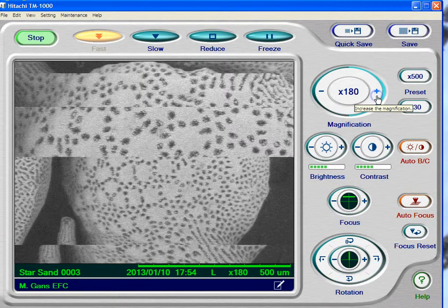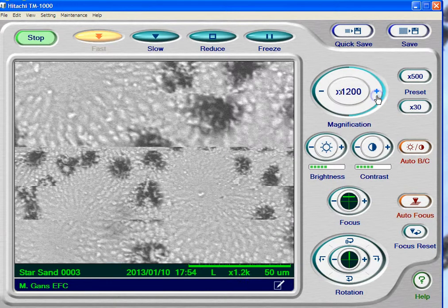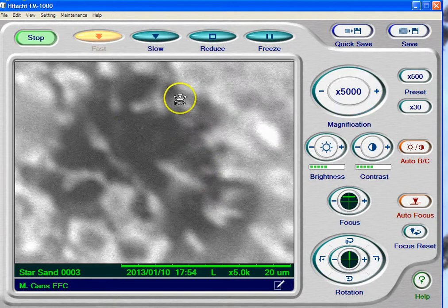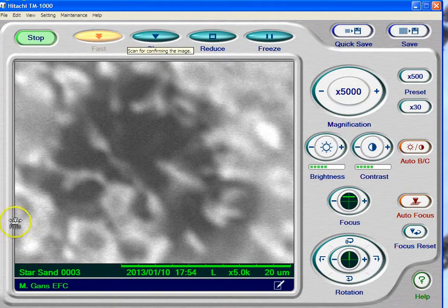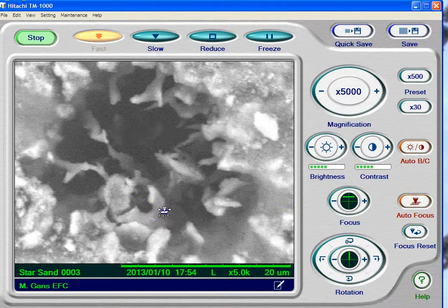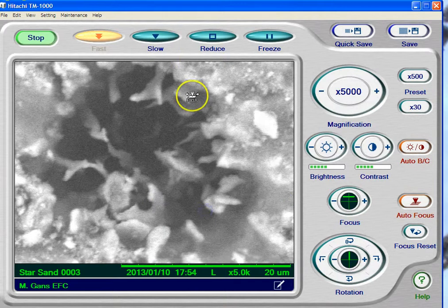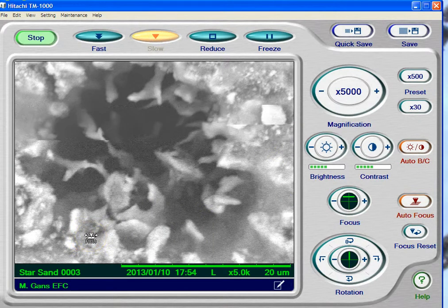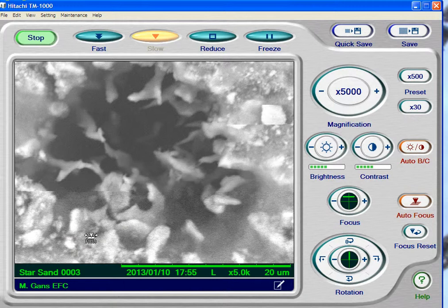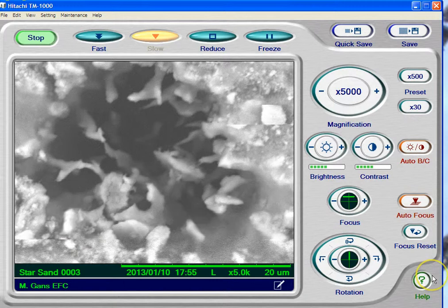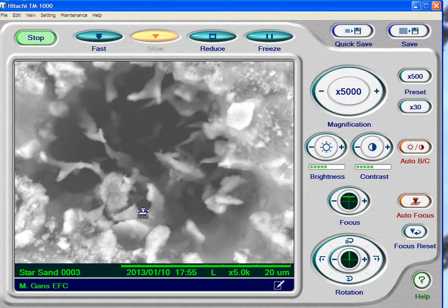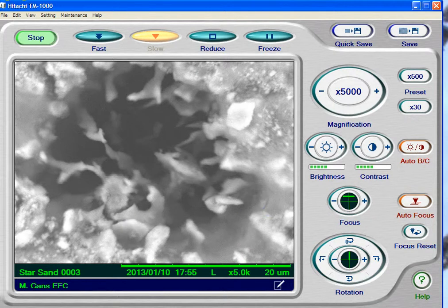So to magnify, you just keep clicking. Let's say you want to make 5,000X — so I'm going to go to 5,000. I'm going to start changing the focus on Fast Scan and I'm getting a pretty good picture. I'll go to Slow Scan here. It's always a good idea to let it scan all the way across one time before you do anything else, so you have something to compare it to. I'm going to start moving and see if I can get anything a little bit better — I think I made it a little bit worse, so that's about as good as we're going to get there.